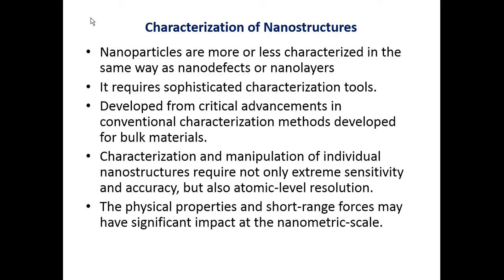Any surface defects, nano defects, and the chemical compositions involved, so many kinds of information with regard to the deposition of nanoparticles and nanofilms on a sample surface can be identified, studied, and analyzed, and accordingly we can get the information with regard to the nanofilms or nanoparticles formed on surfaces of a substrate or material.